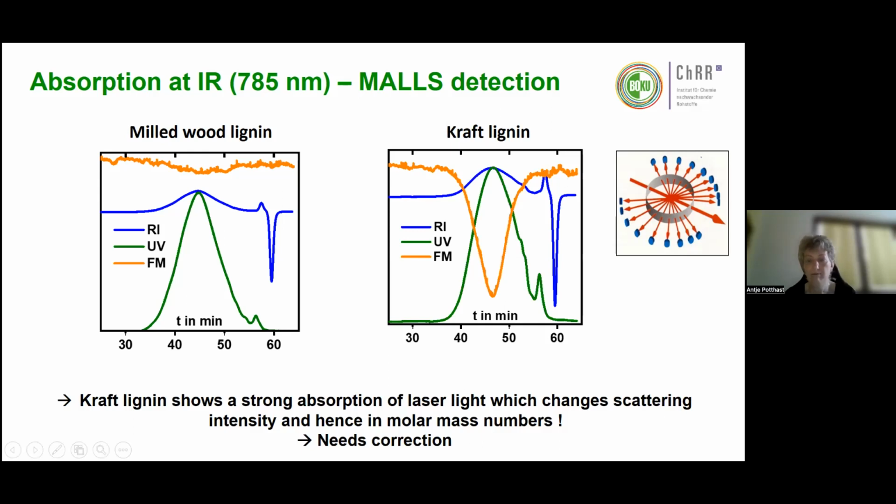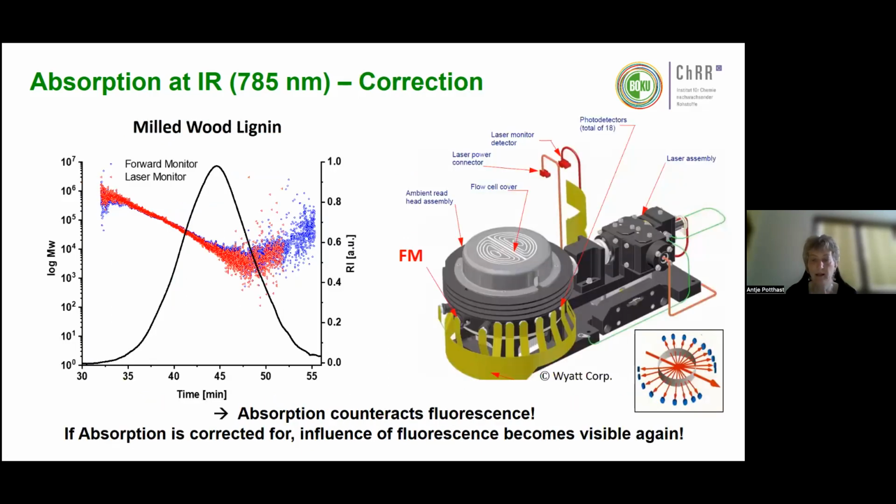So we make a mistake here. Fortunately, we have a choice to correct that. I only know of the MALS system which allows this correction. I don't know of any other systems, but maybe it's possible in other MALS systems as well.